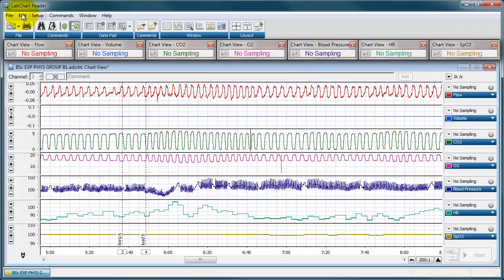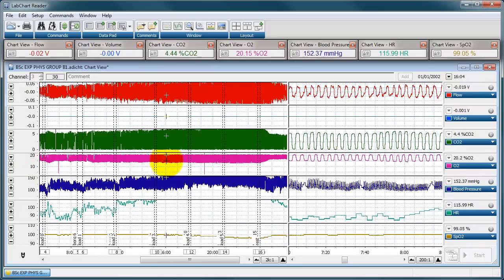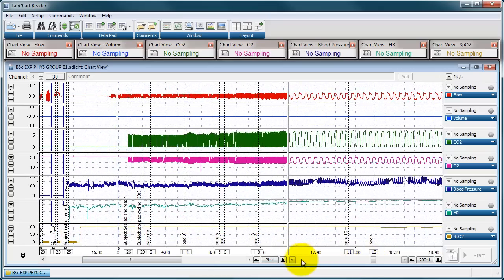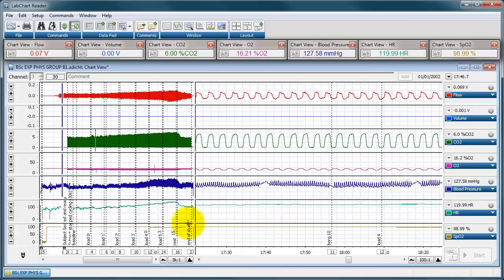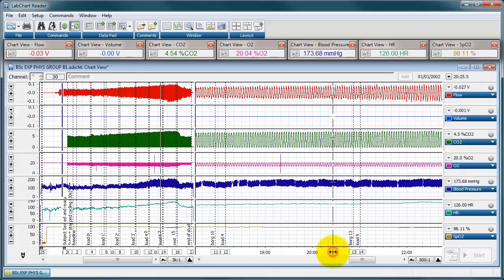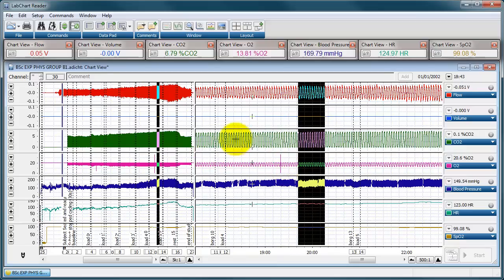One useful function is the split view mode. Move your cursor to the far left side until it changes to a double-headed white arrow, then click and drag to create two independent screens showing the same data set. You can scroll or zoom one without affecting the other. A recommended use is to show the full experiment overview on the left while scrolling through data on the right for analysis, so you always know where you are in the experiment.